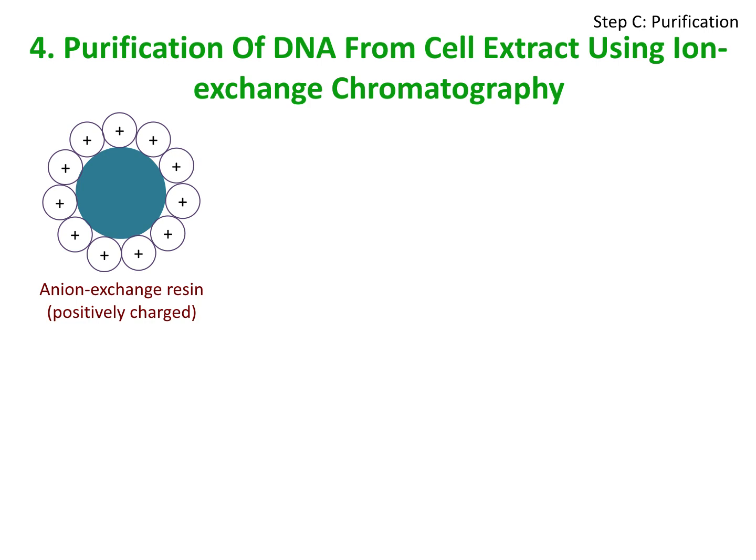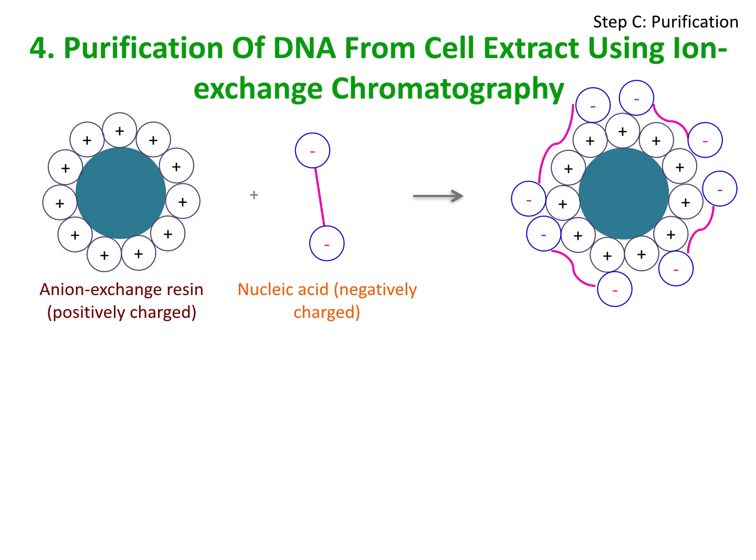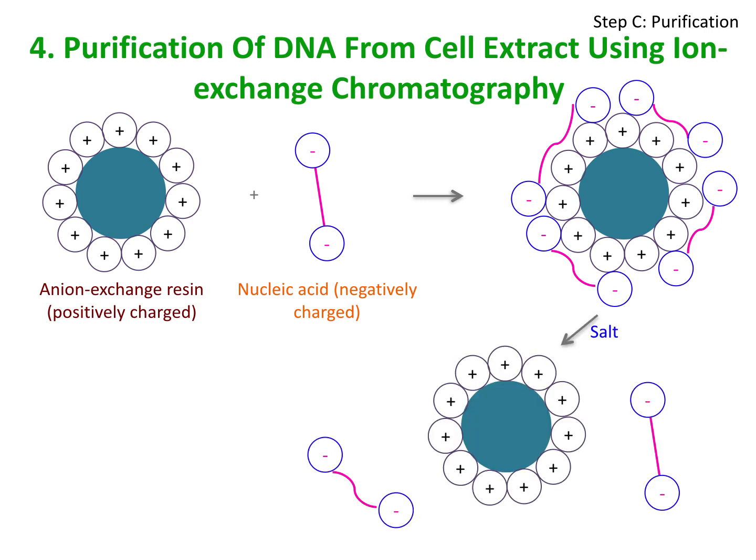You already know that the nucleic acids DNA and RNA are negatively charged because they contain a negatively charged phosphate group, which helps them in binding to the positively charged resin. Now, the presence of salt interferes with this electrostatic attachment. Depending on how tightly the nucleic acid molecule is bound to the resin, the salt concentration needed to break this attachment varies. By gradually increasing the salt concentration, you can separate different types of molecules one after another from the resin.